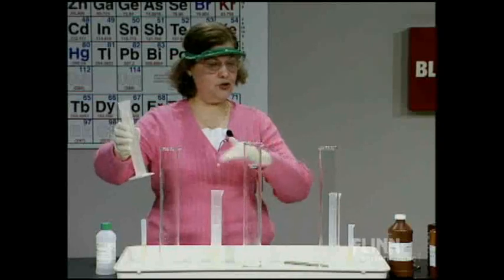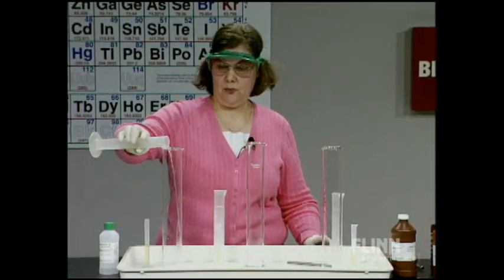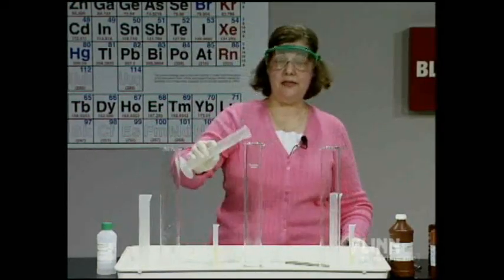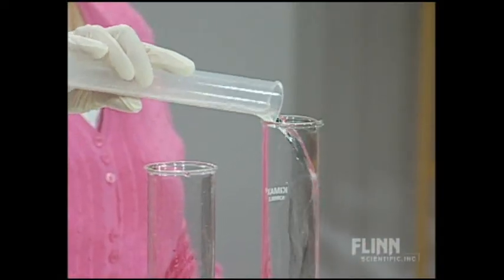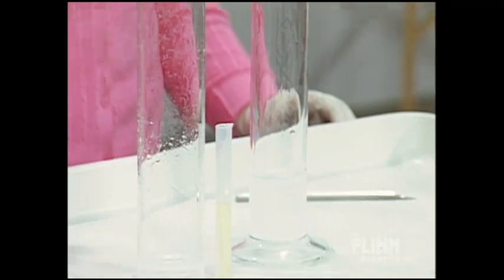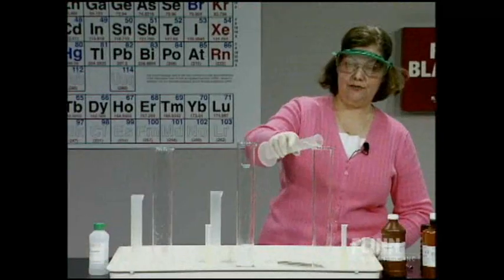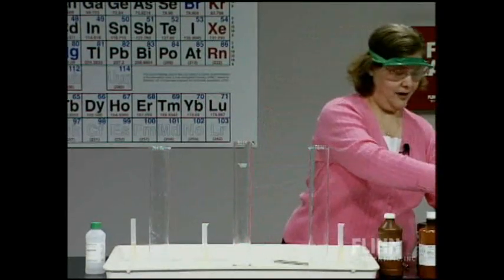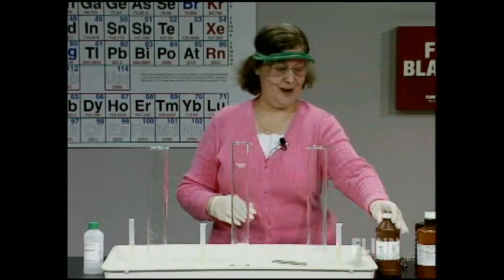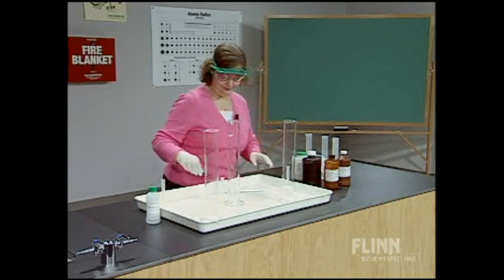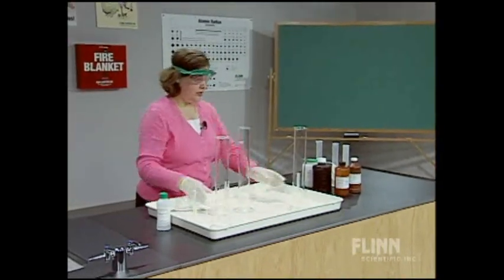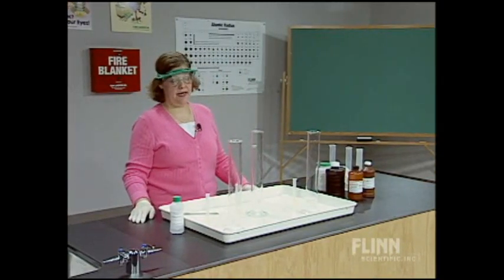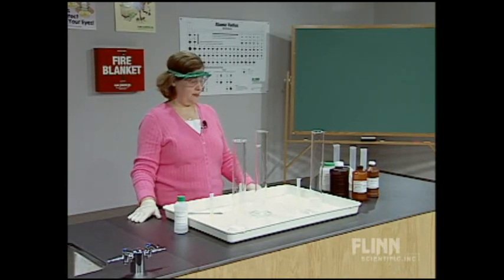I'm going to go ahead and add the hydrogen peroxide to all three. Now, even though hydrogen peroxide is a very reactive compound, nothing happens unless you add a catalyst. Many different substances will catalyze the decomposition of hydrogen peroxide. I have three small graduated cylinders here with two-molar potassium iodide. Iodide is a very good catalyst for the decomposition of hydrogen peroxide.